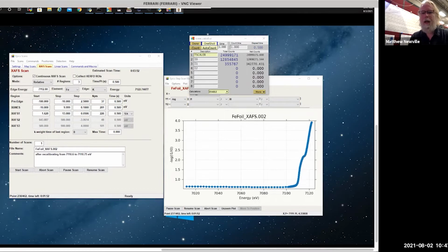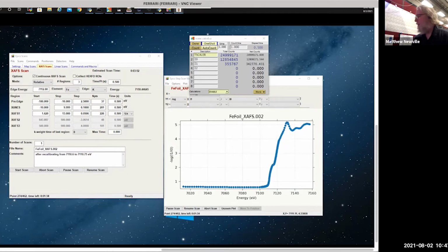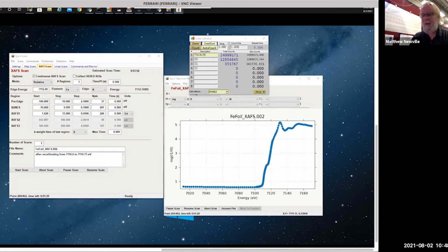Yeah, okay. So if you have any other questions, and we will keep going after this. I have some other foils mounted on here, but maybe in the interest of time, we should switch to manganese and measure a bunch of manganese compounds. Typically in this school, you're making manganese samples, and I have a bunch mounted up. I'll show you that. Those mounted up.